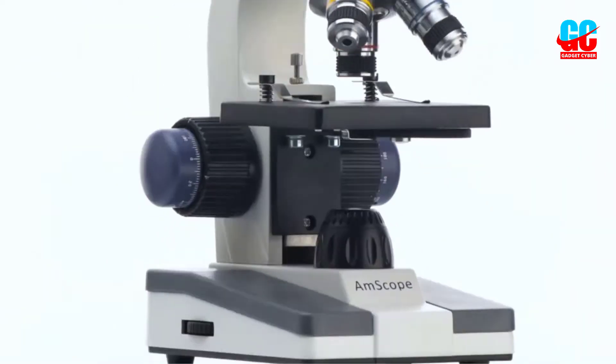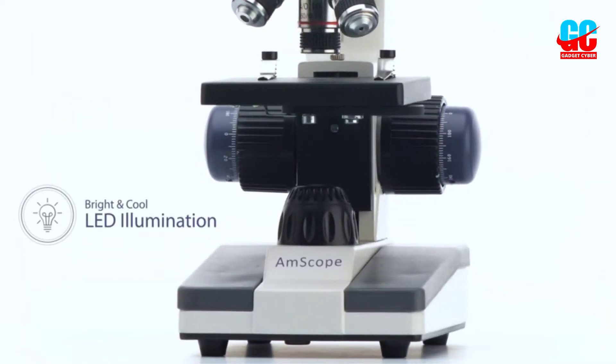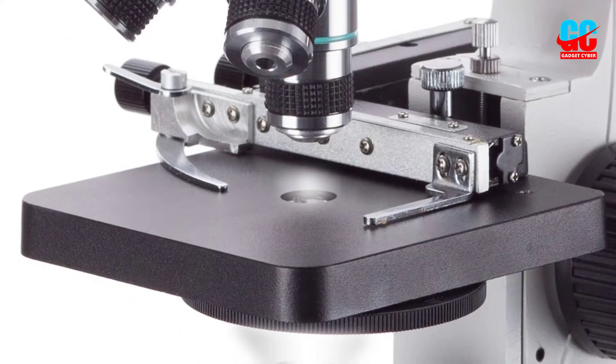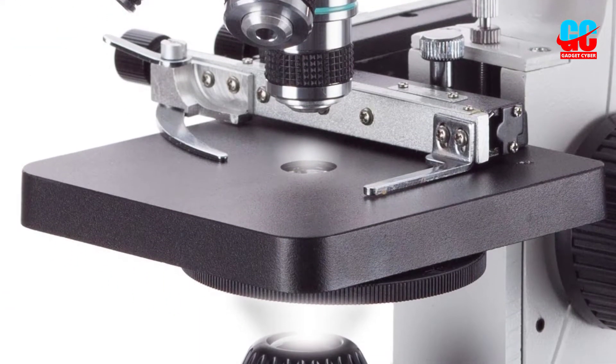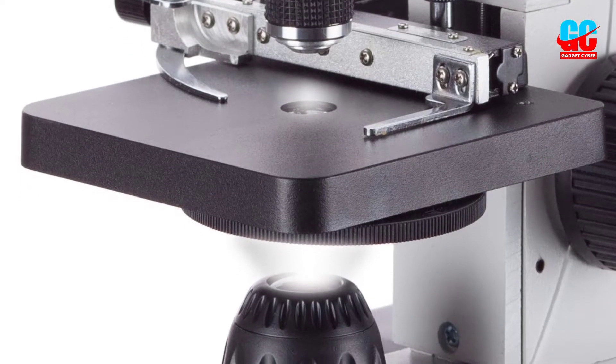Five different magnification levels are available, ranging from 40x to 1000x. This isn't as high as some of the more expensive models, but it's still sufficient for most uses. There's an LED illumination system built in, which we found to be very useful.